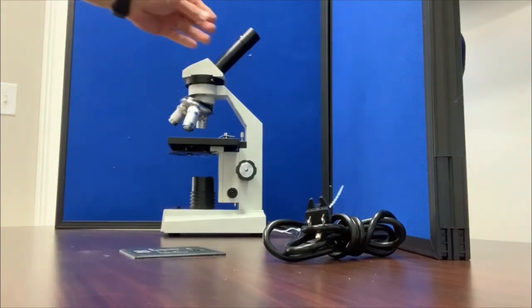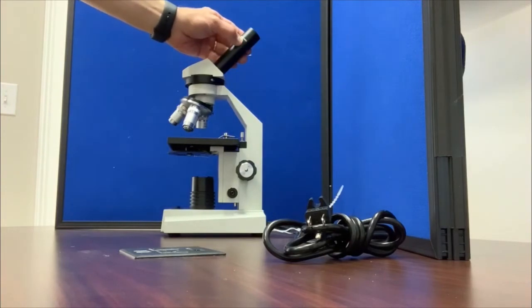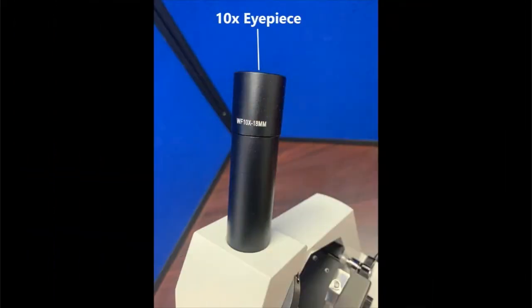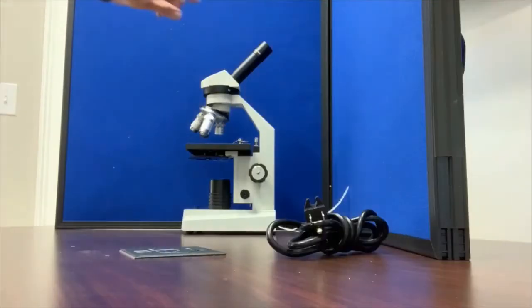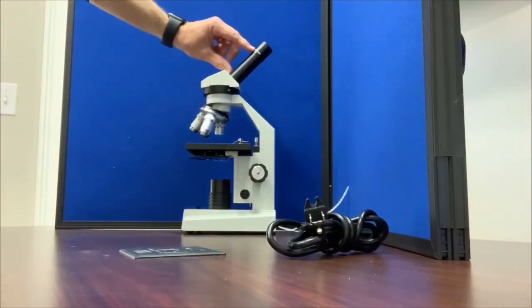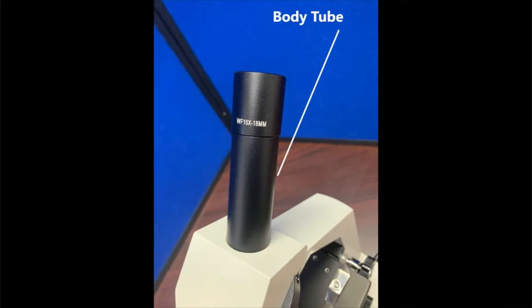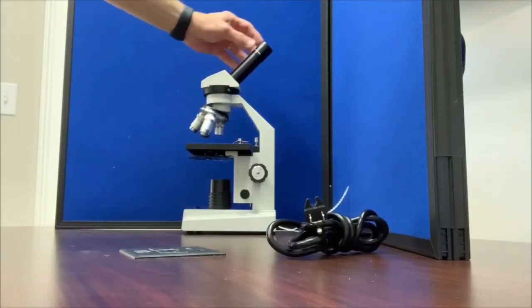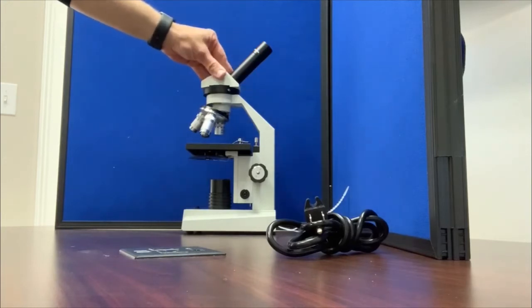This particular eyepiece, or ocular, is a 10x eyepiece, which means it will magnify 10 times. This portion of the microscope, this tube, is called the body tube. The body tube holds the eyepiece on the microscope.